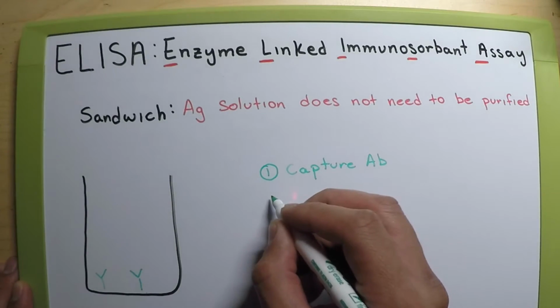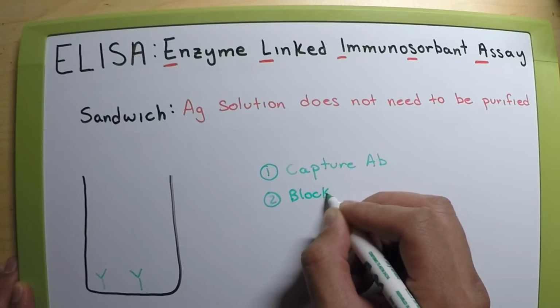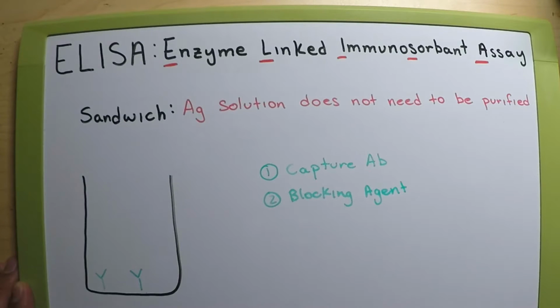Step 2 will be to add the blocking agent. And it's the same thing where we go ahead and fill in all of these gaps.